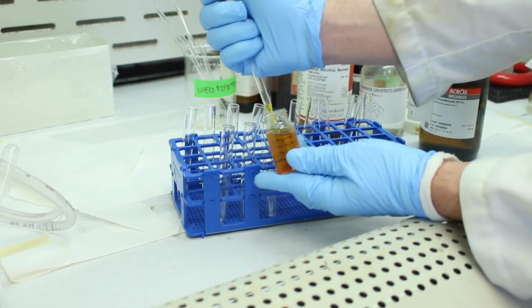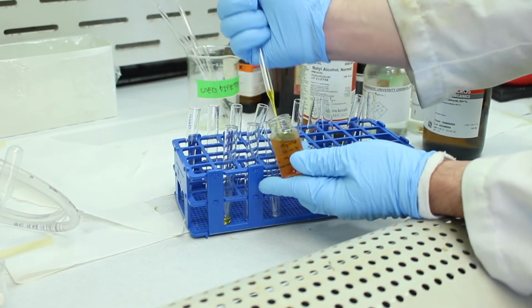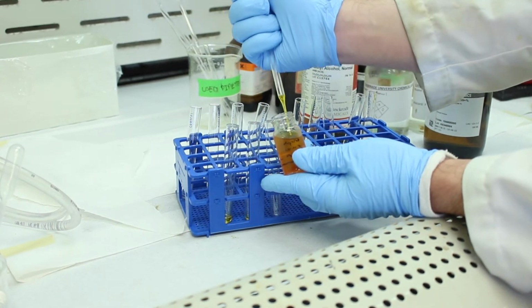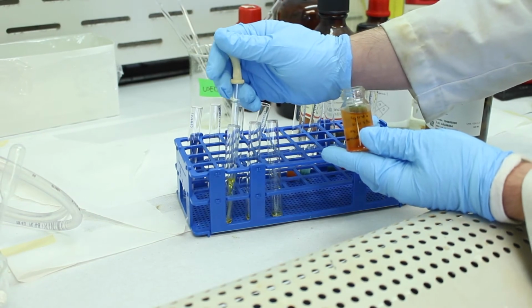So I'm going to add some to 3 test tubes. We're going to test 3 compounds. So add a little bit, add a little bit, add a little bit. There's a little bit too much in that one.